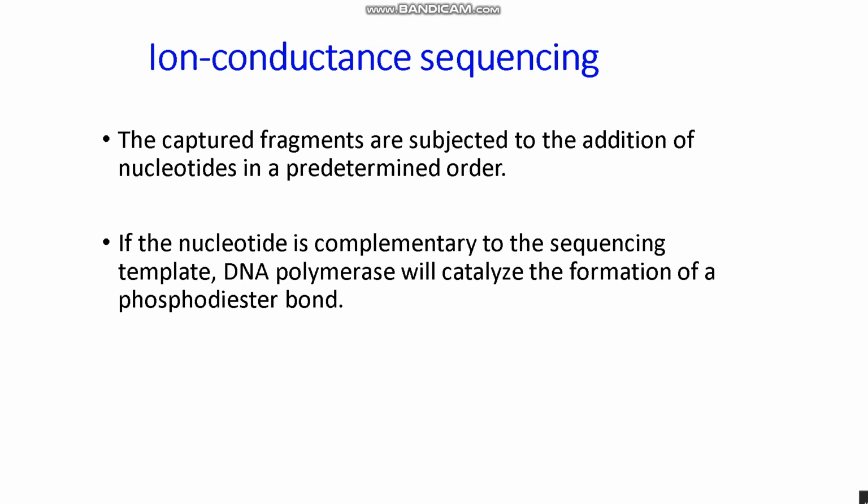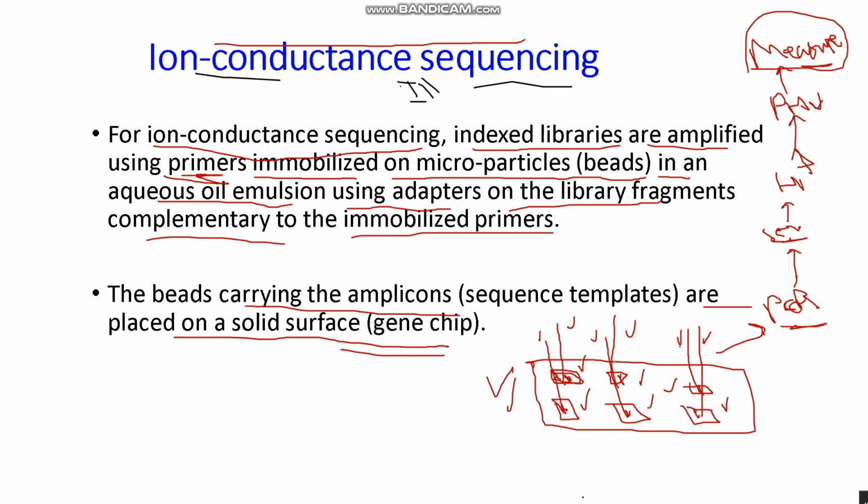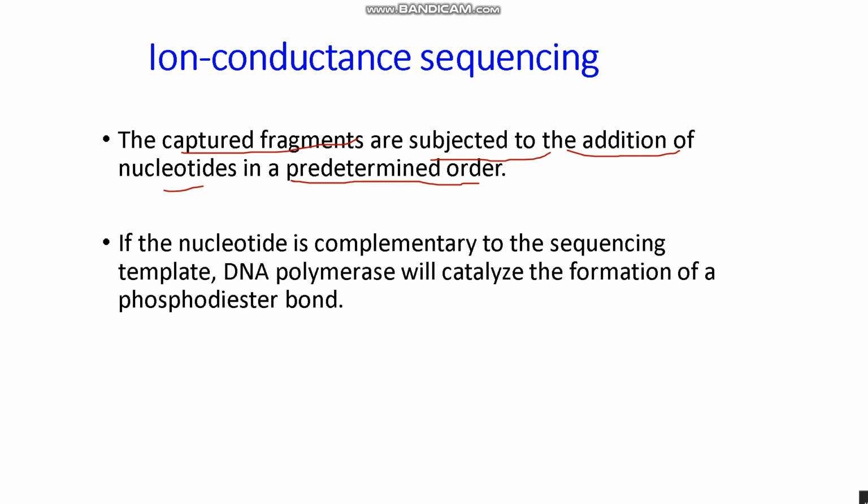The captured fragments are subjected to the addition of nucleotides in a predetermined order. The captured fragments on the primers are subjected to addition of nucleotides.